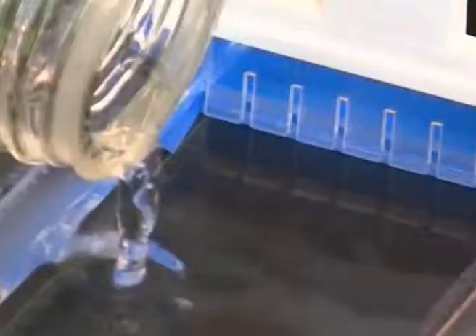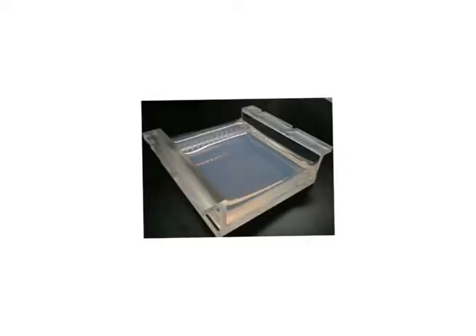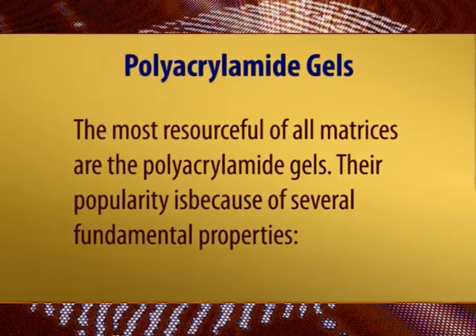Agarose gels. Agarose is a polysaccharide taken out of seaweed. Agarose is a purified linear galactan hydrocolloid extracted from agar or recovered directly from agar-bearing marine algae like Rhodophyta. Agarose gels are extremely easy to prepare and also non-toxic. Agarose gels have an extensive range of separation but comparatively low resolving power.